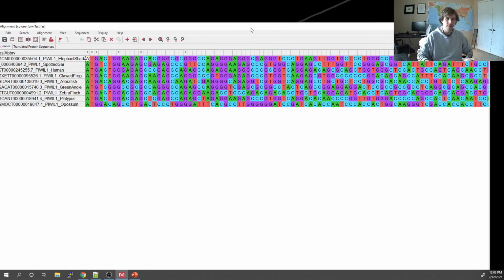The great thing about grabbing the coding sequences, as opposed to getting the cDNA, is that the coding sequences are already in frame. I can't tell you how much of a pain it is to find the reading frame in a sequence, because remember, any DNA sequence can be read into codons 6 different ways, depending on which base we start counting from.